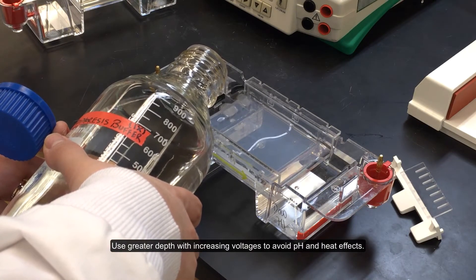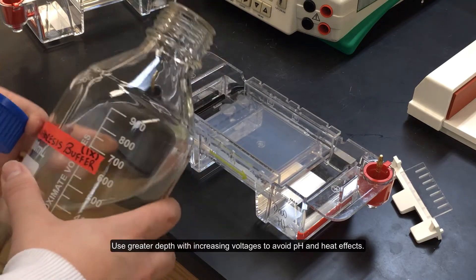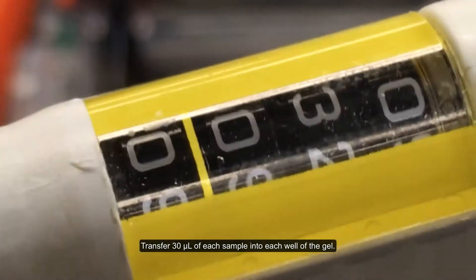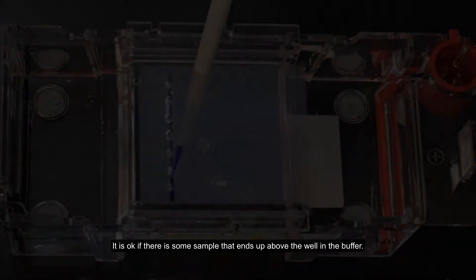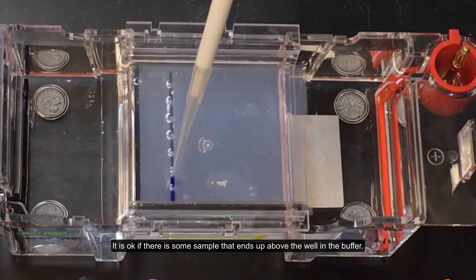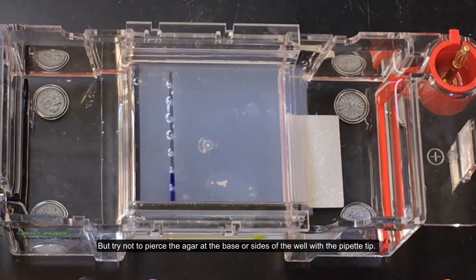Use greater depth with increasing voltages to avoid pH and heat effects. Transfer 30 microliters of each sample into each well of the gel. It is okay if there is some sample that ends up above the well in the buffer, but try not to pierce the agar at the base or sides of the well with a pipette tip.